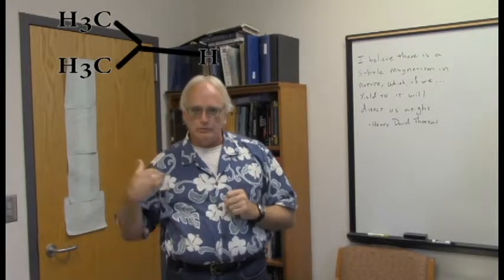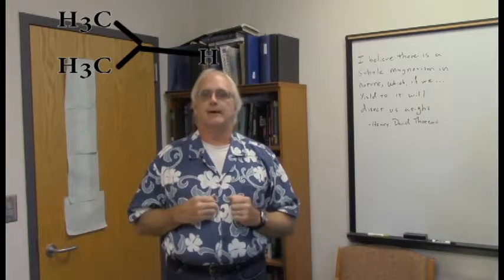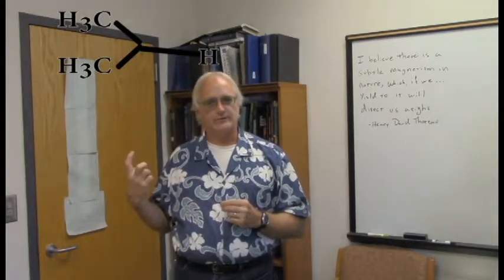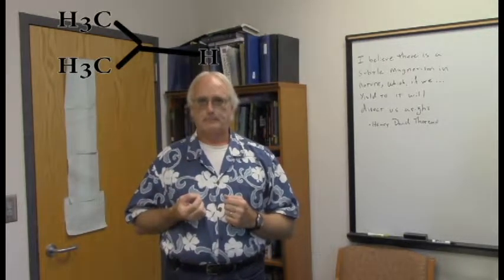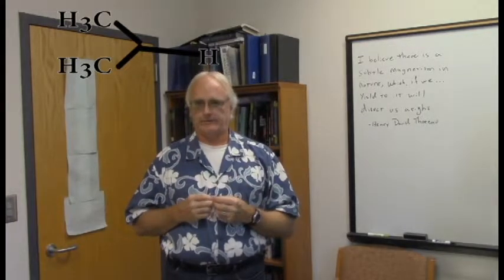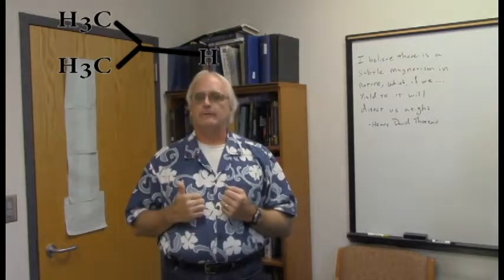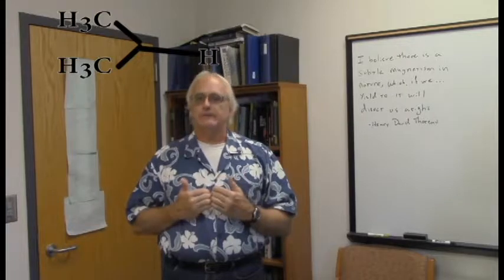Okay, so we've moved one carbon-carbon bond further into this molecule, gone from 2 equivalent CH3s to a CH group. So we've expanded our known pieces a little bit, and we've taken a step further into the molecule here. And we look at the resonance of this CH.